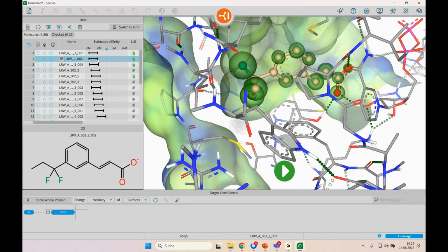My gut feeling is always to trust the upper value, just to be absolutely sure. But I've seen some examples where actually the lower limit was reached. So the range is quite forgiving, but it's worth it. So for an assessment, it's fine, but it does not replace any experimental data that you can collect on that.